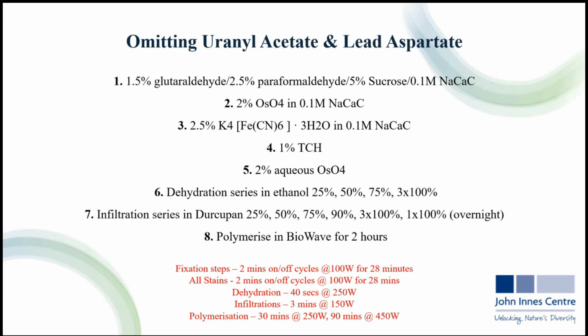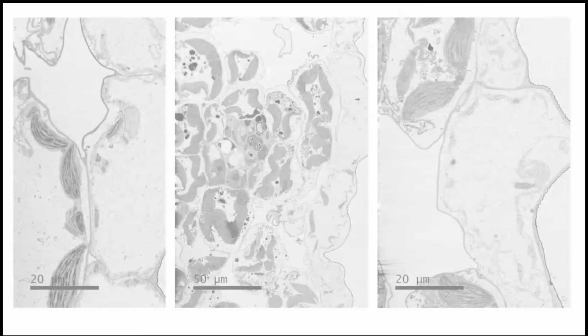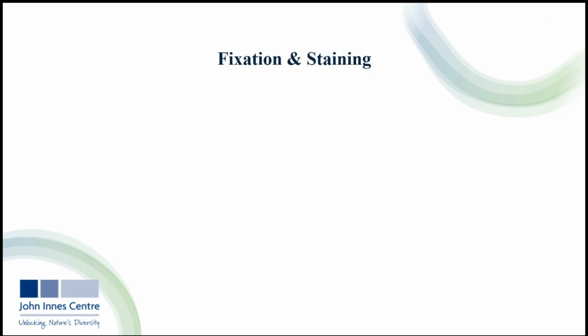If I just quickly go back to the protocol, as you can see at the bottom, the steps were significantly longer than the traditional protocol that we use. These were much, much longer, which made me think perhaps the fixation might have been a bit too aggressive for our plant samples as they are very delicate. So I thought, okay, we'll try to fix the traditional way and do an overnight fixation instead. We did that and then continued the process in the BioWave using that same protocol.